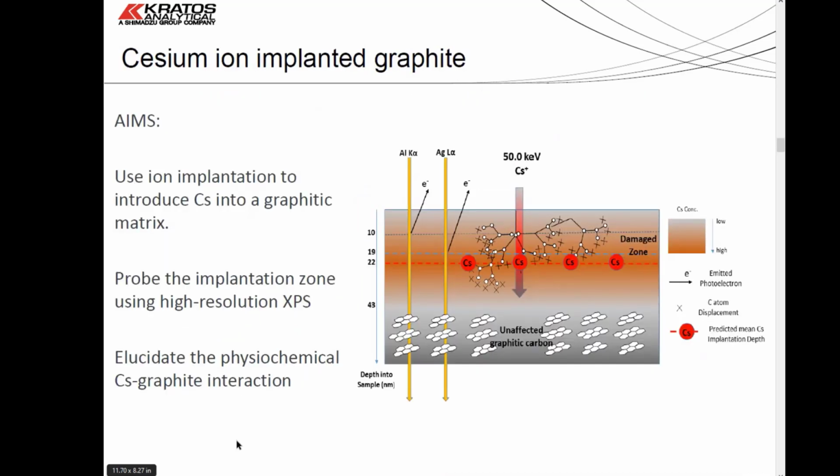Obviously, some of these experiments can take quite a long time to run through. So there is a certain degree of experimental design optimization that you need to go through, where the importance is getting as much information as quickly as possible. If you've got 90 locations or 200 locations, and you run a survey scan for 2 minutes at each place, you can rapidly start to stack up on the time. So some of these experiments are overnight jobs rather than just sitting in the afternoon.